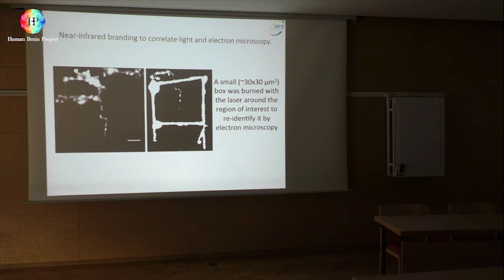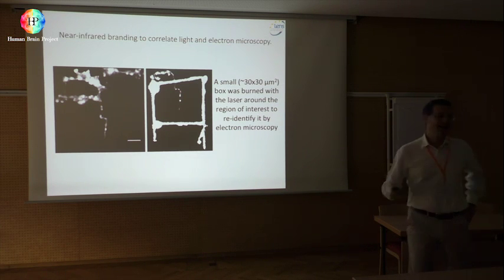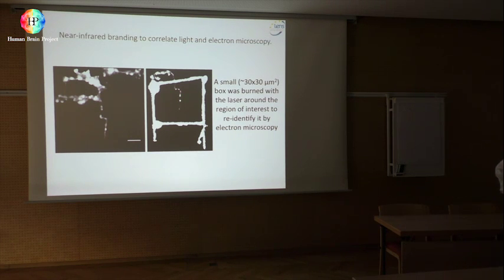One thing, so once you have done all this, you get a stack of electron microscopy photos. But the slices, you can also use them, right? Yes, of course. At that point they cannot be used with two-photon anymore, but that was exactly what we needed, to understand if there is a contact or not. But you're right, at least with two-photon they cannot be used anymore because they are prepared for electron microscopy.